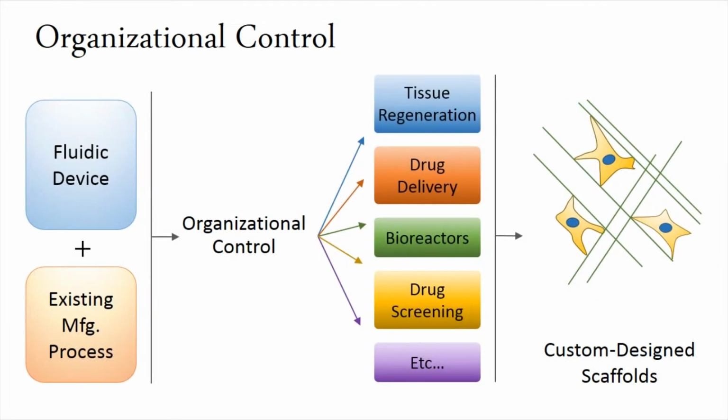My project began with the challenge of introducing the ability to control the composition within a scaffold by adding a fluidic device to the existing manufacturing process. This will promote new innovation in the design of our scaffolds and allow us to tailor our scaffold design to each specific biomedical application. To tackle this problem, I helped design and test several prototype devices.